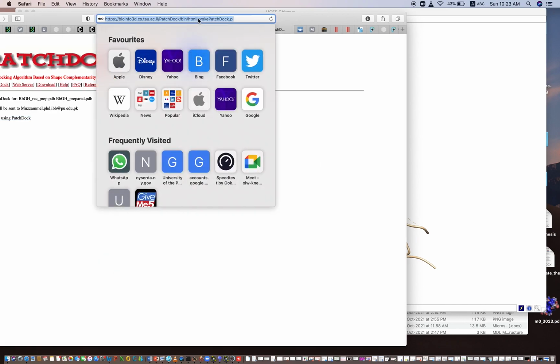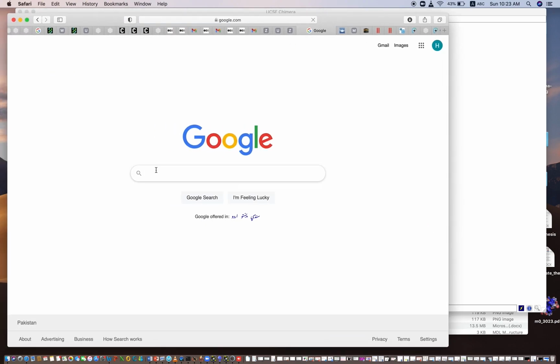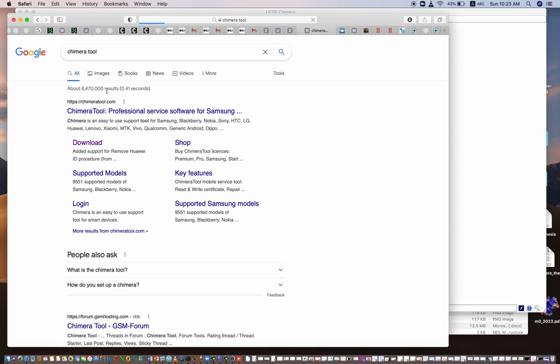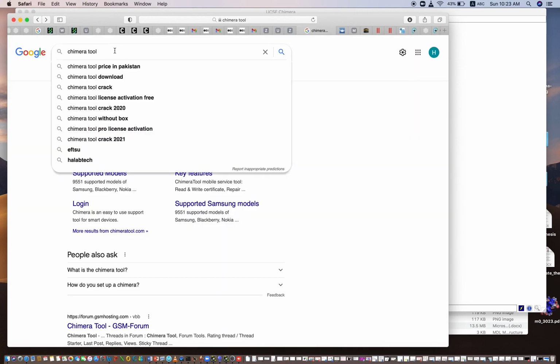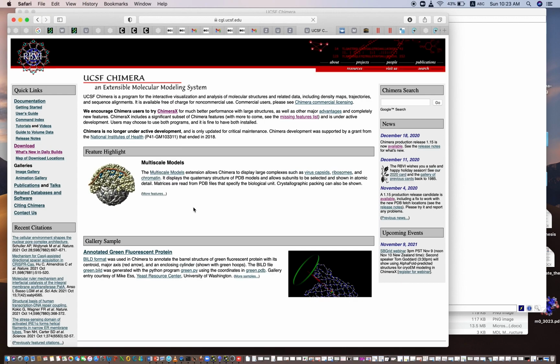And if you do not know about it, I am going to do it again for you. Go to Google, write Chimera tool. This page will open. No, this is not Chimera. University of California, San Francisco. Yes, this is the Chimera. This is by the University of California.